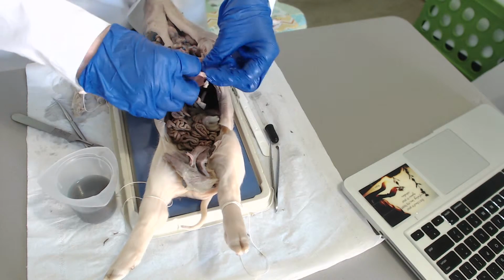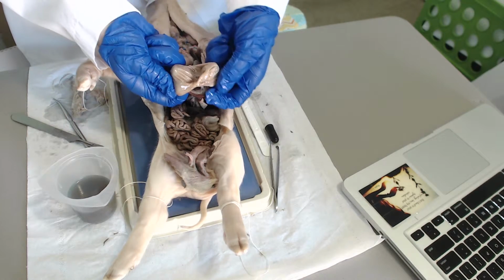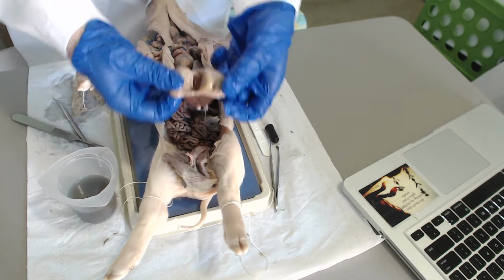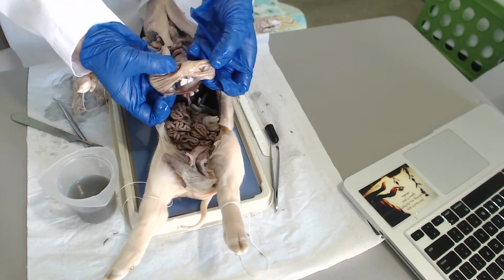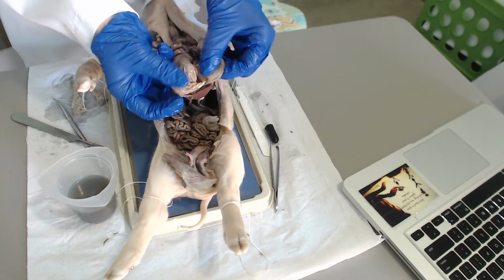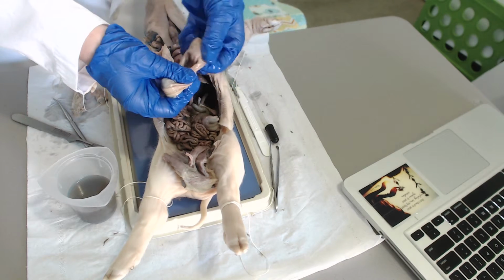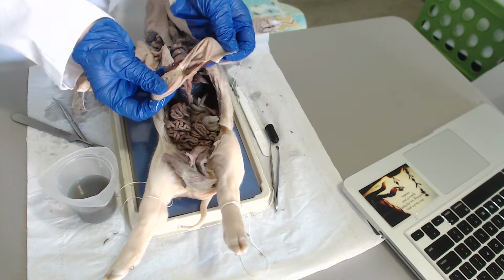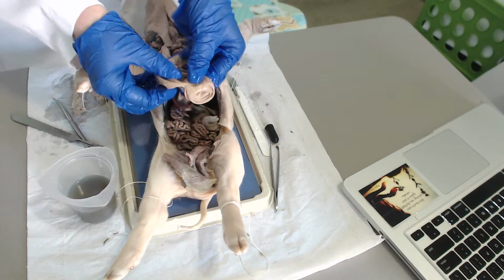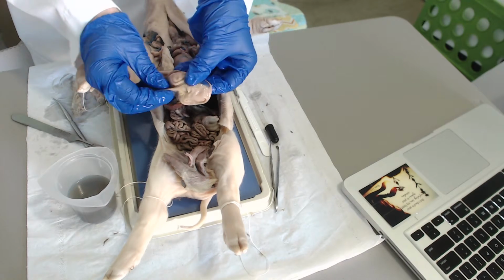We're just going to reverse or open up the stomach so we can see it a little better. So here you go. You kind of feel the coating of the stomach. It's very flexible, and you can pull it apart.